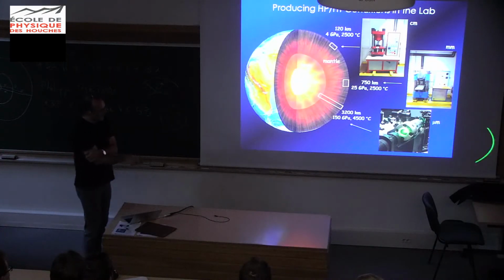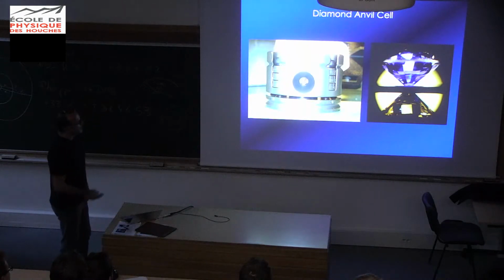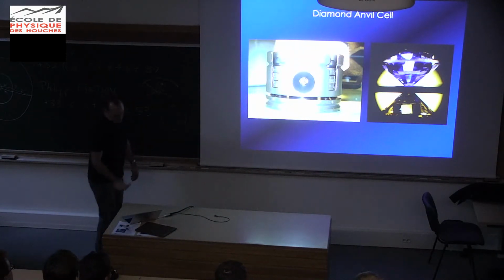Okay? And now we're going to move to the laser heated diamond anvil cell. It's a very simple design. It's a uniaxial press, but now the anvils aren't tungsten carbide, they're diamonds that you see here. This is not exactly a zoom in on this. These are clean diamonds, these are horrible. But it gives you an idea of the principle.